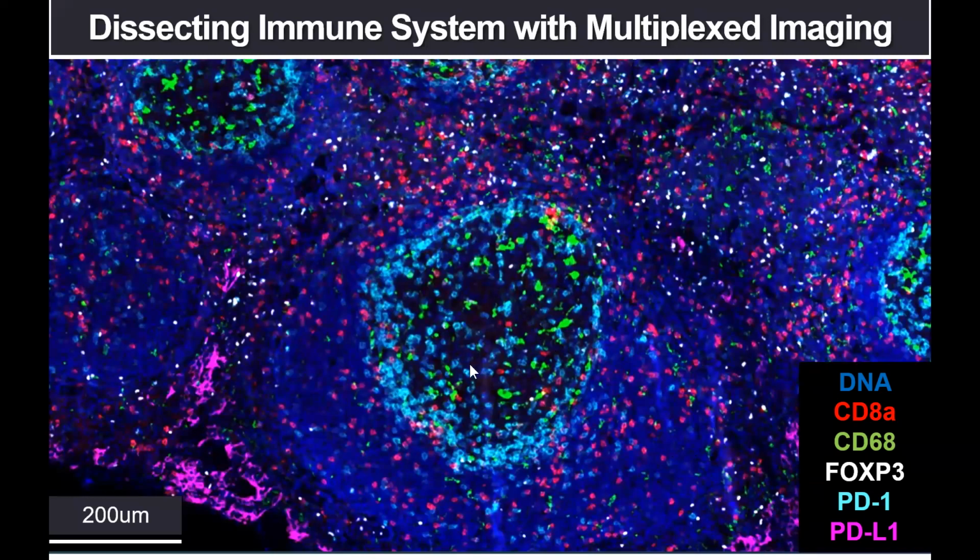So that's just a simple example to demonstrate what you can see if you're not limited by your tool to single-color or two-color images. Now you have the ability to probe multiple, complex cell-to-cell behaviors.